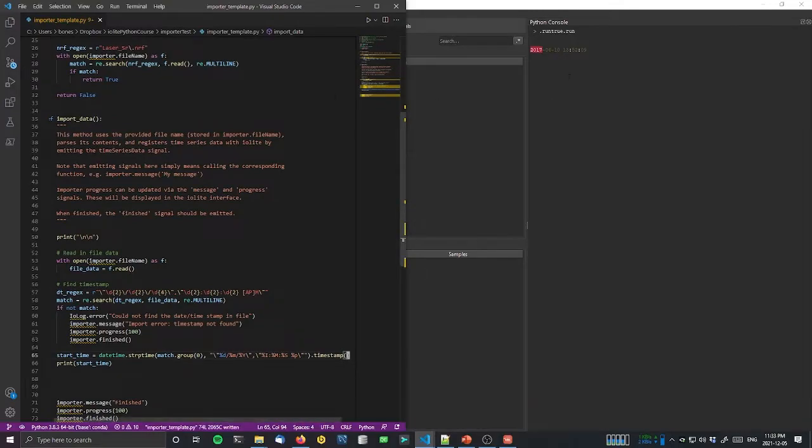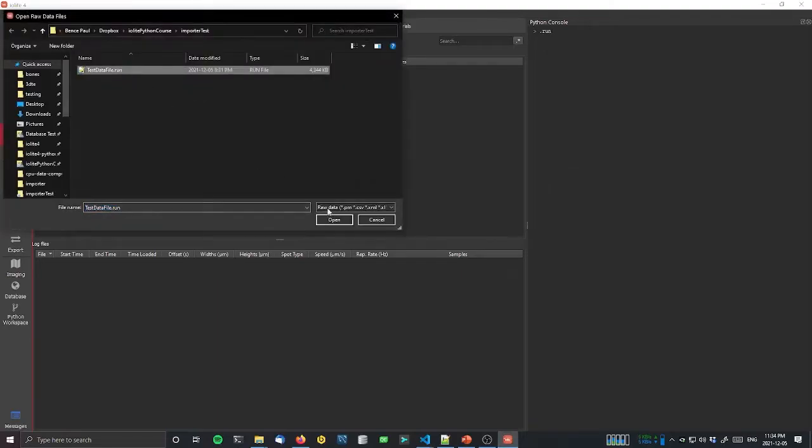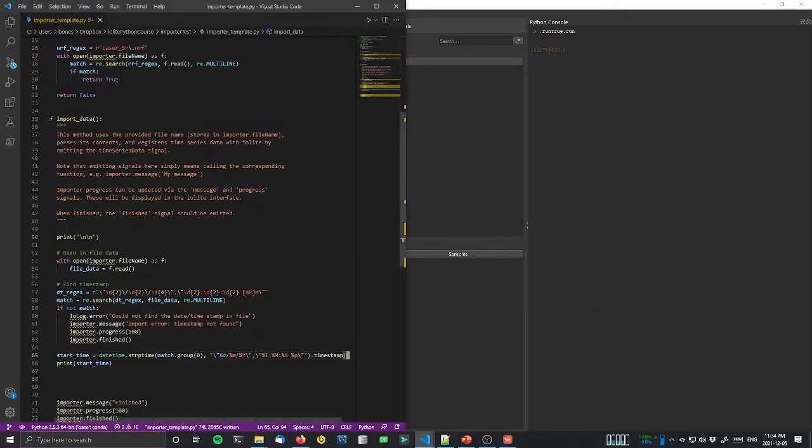So now when we run this, we'll clear this, open this, and you can see that we get our 1.5 billion seconds since epoch. That is what we're actually going to use when we store our values, and we're going to add that value to each of the measurement times in our importer. Okay, so we've now got the time as seconds since epoch.